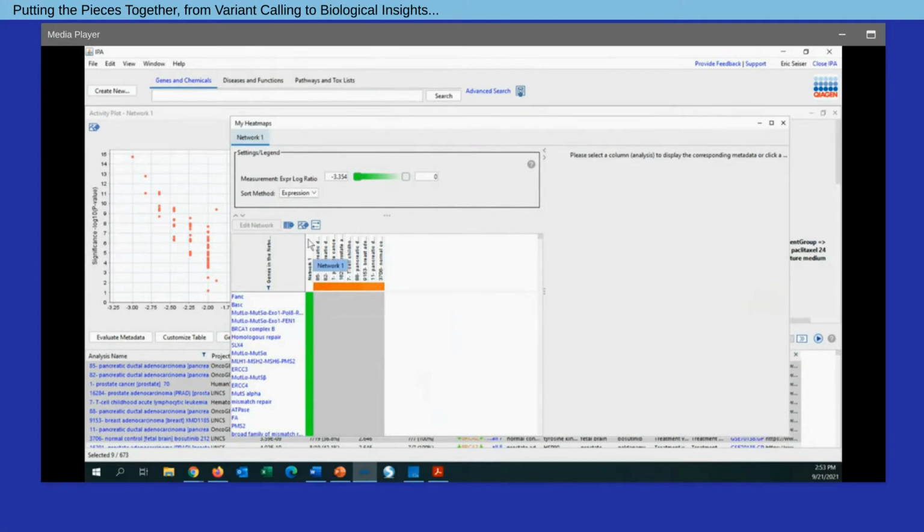And what we'll generate is this heat map based view where as I scroll down, I'll start to see a number of genes within a cluster here that would say that they show MLH1, again, a lot of the FANC family of genes, BRCA2, those all have loss of function variants in my Lynch syndrome cohort.